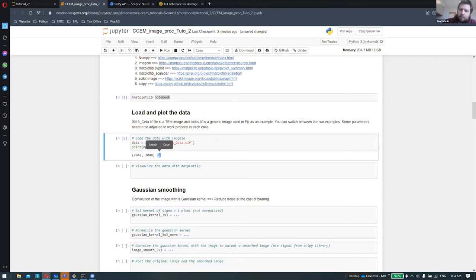So this data that you have here is actually not the raw data collected directly from the microscope. This has been saved as a display, and when you do that, the data is saved as an RGB file, and each channel of the RGB will be part of these three channels that you see here. And this is not what we want. We want this two-dimensional array, to be able to navigate through the different pixels of the array.